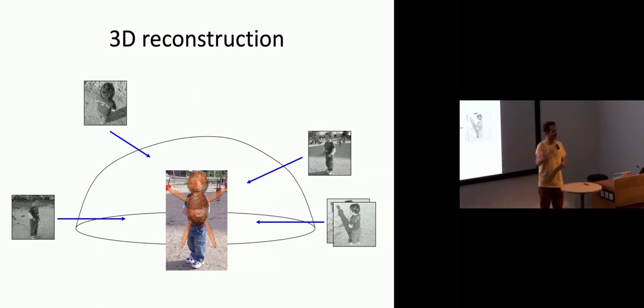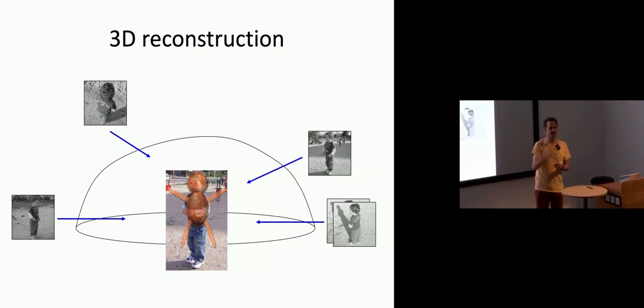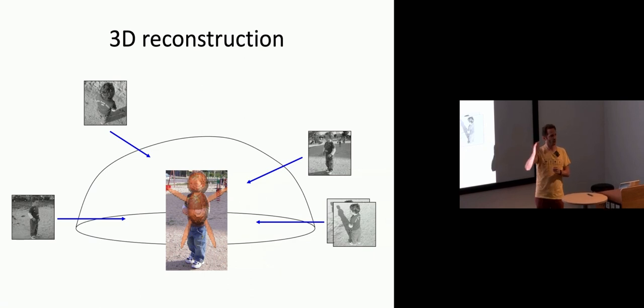And this is the result of the relative orientational assignments that I've made not being entirely correct because I didn't have the right 3D reference model of Jan. I've introduced errors in the angular assignments. And these errors are not harmless random errors. They're actually systematic errors which reproduce the orange puppet in the 3D reference. And this is called model bias.